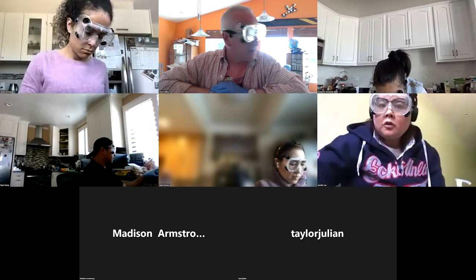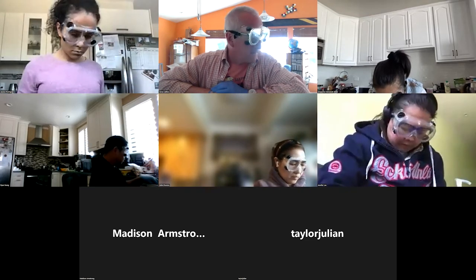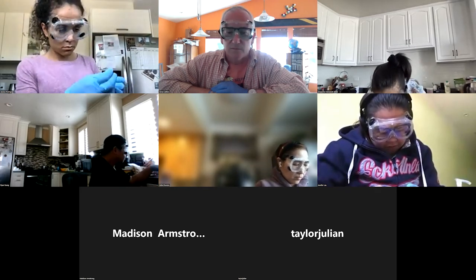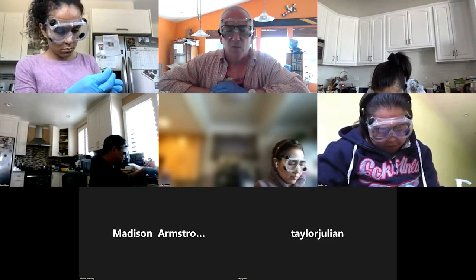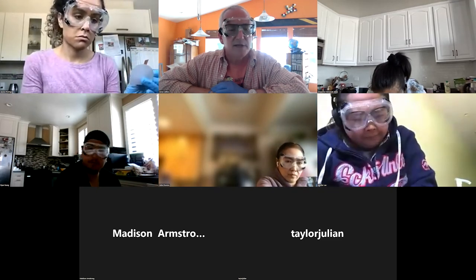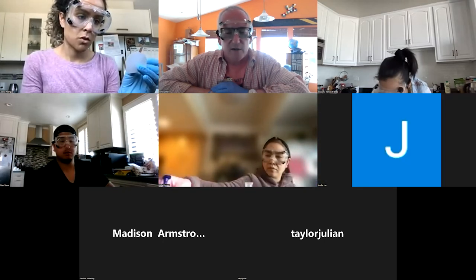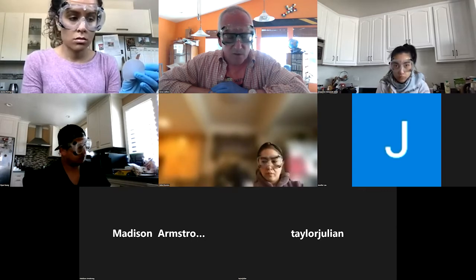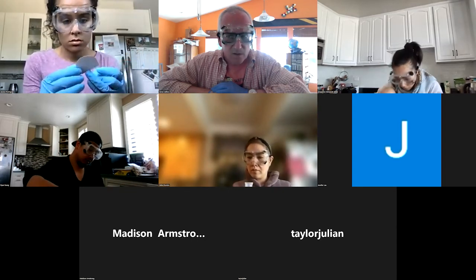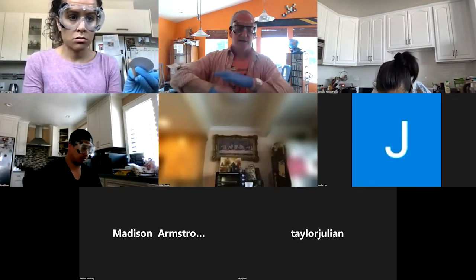So the color of yours was, what was it closest to, 6 or 7? 6. I think it's 6. What other, did anyone get a more basic pH with the soap they used? What were the different soaps people tried? What did you try, Taylor? Mine was Suave coconut water, and I also got 6. Huh. So that's like a pump soap kind of stuff?